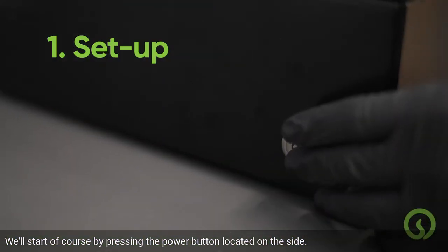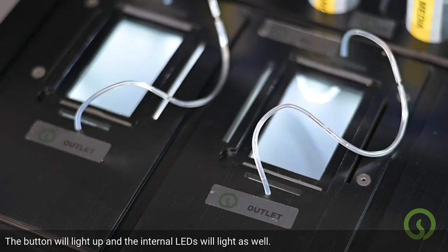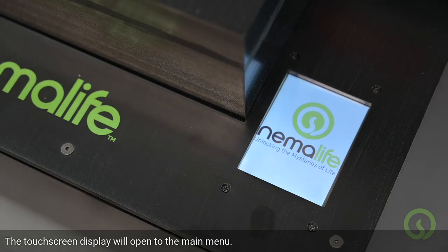We'll start, of course, by pressing the power button located on the side. The button will light up and the internal LEDs will light as well. The touchscreen display will open to the main menu.